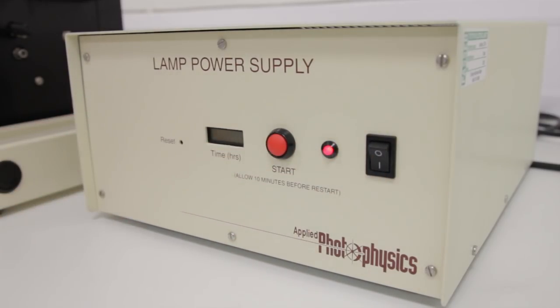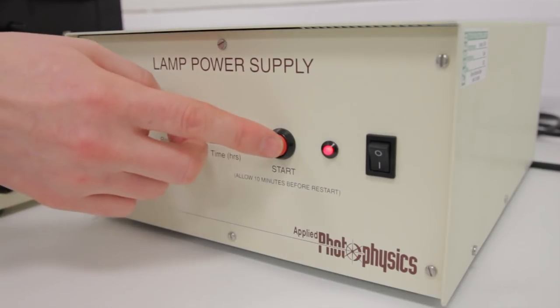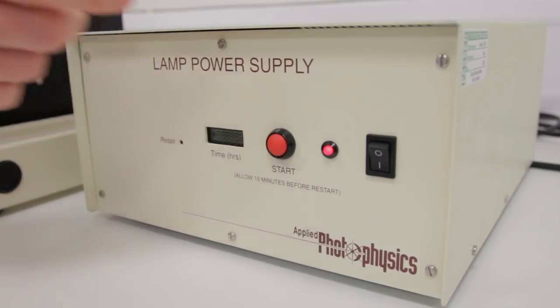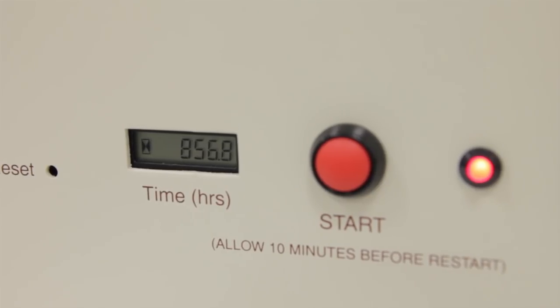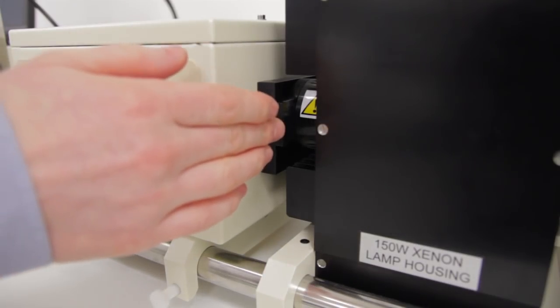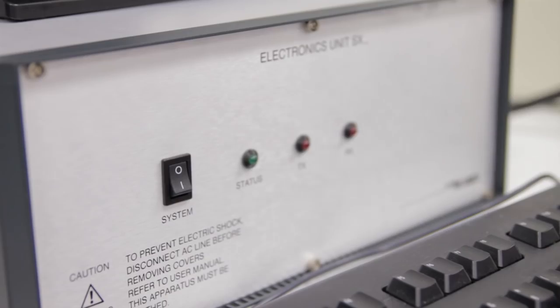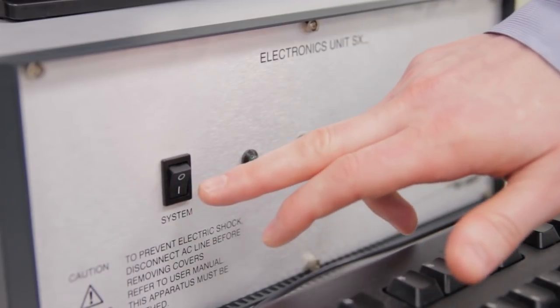Usually the first thing we need to do is switch on the lamp as this takes 20 minutes or so to stabilize. Make sure the shutter is in the open position. We then need to turn on the electronics rack and start the software.